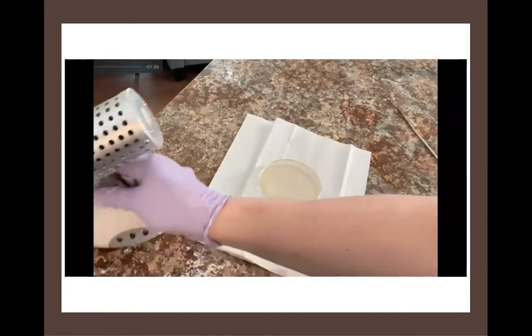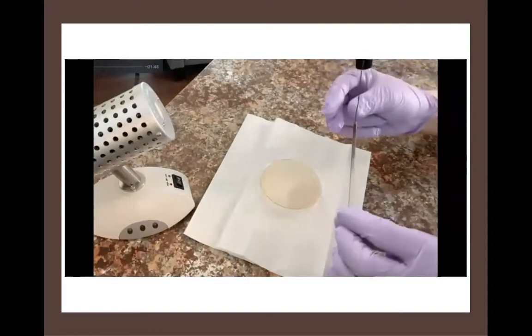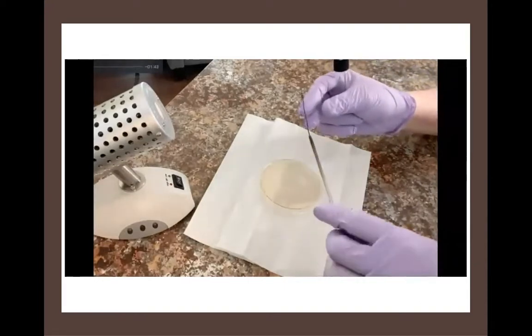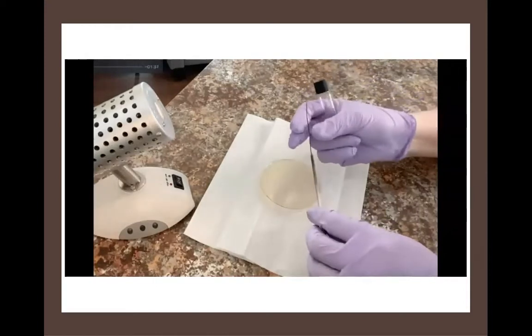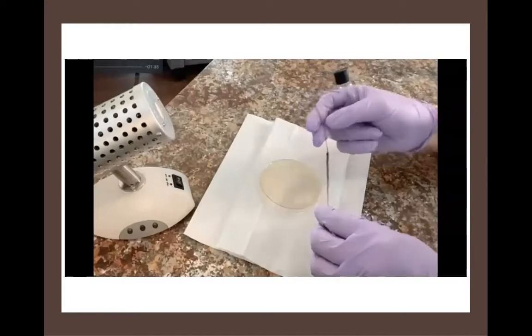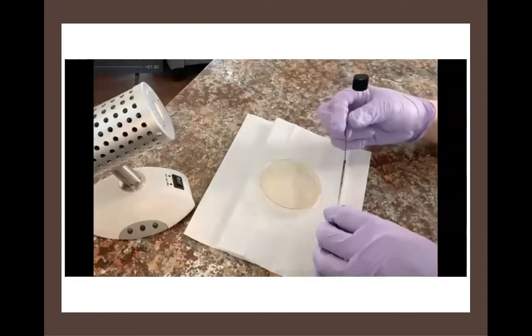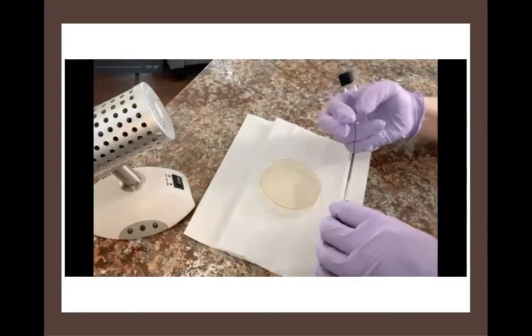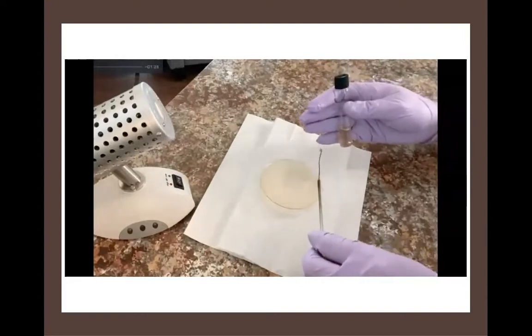I'm going to move my incinerator into place here as I get going. My inoculating loop, my tube full of bacterial culture. Now, this inoculating loop is clean, it's sterile, and I want you to notice that I'm going to start bending this wire. The wire is wire for a reason. When we're inoculating things, especially the surfaces of plates, we can bend this wire to make it easier to spread the cells out. Now you can bend it as far as you want or as little as you want.